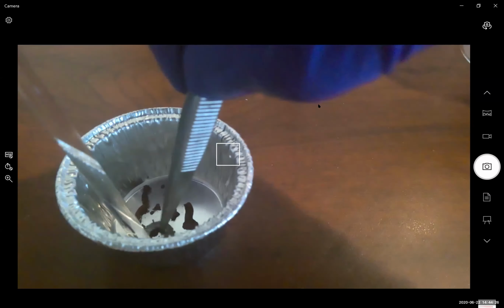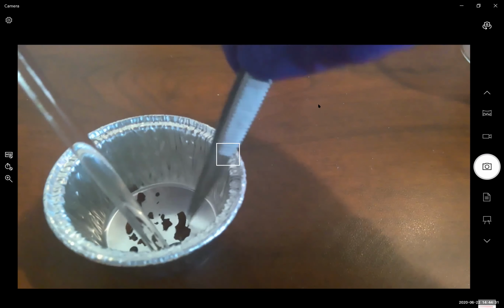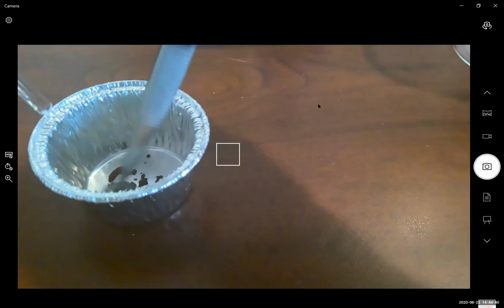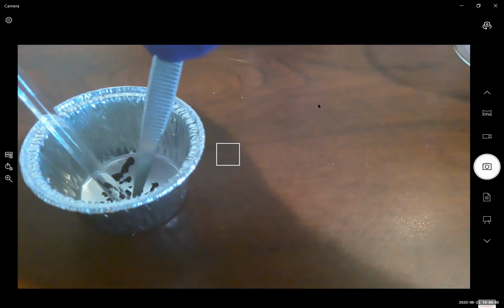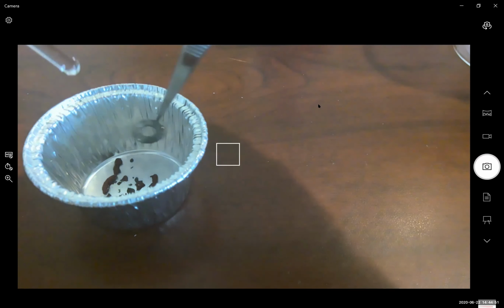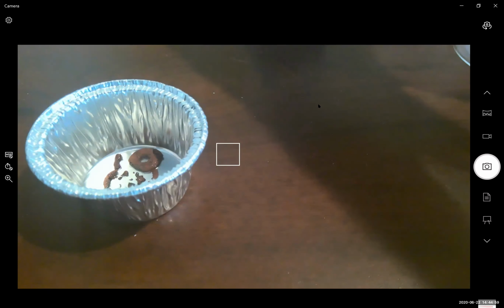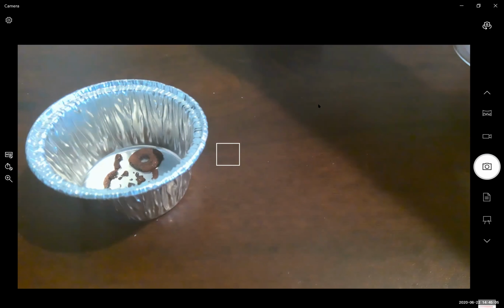And make sure to get the inner ring as well. Okay, we've almost scraped off all of our copper. Just make sure to turn it around and really get off all the copper. Okay, so this is pretty clean now. So let's repeat for our second piece. And if it falls apart, make sure to grab any of the copper pieces that end up in your other container.